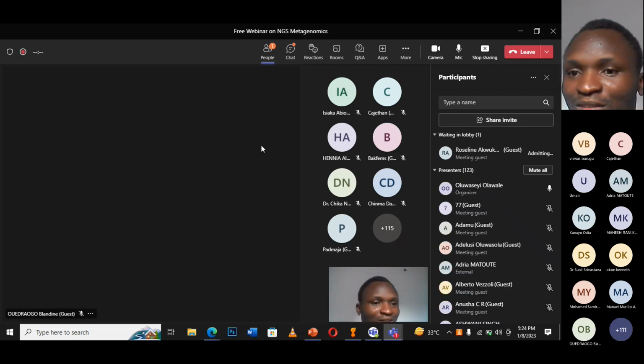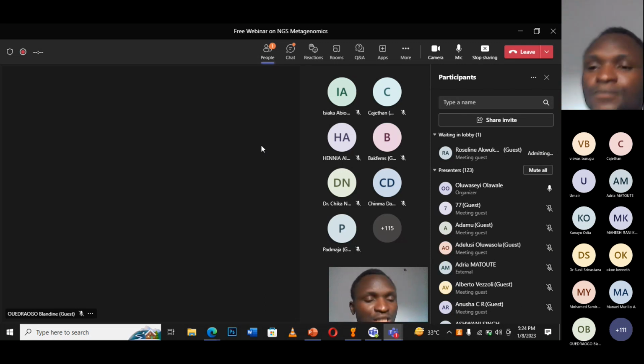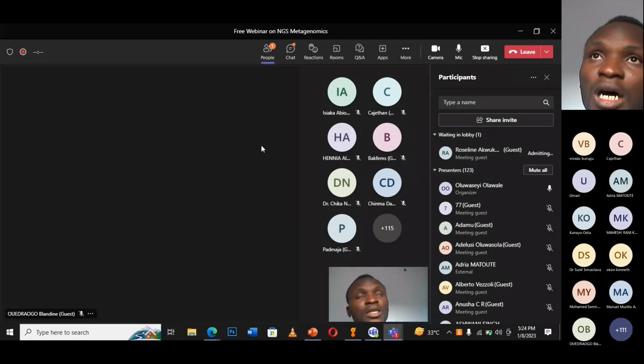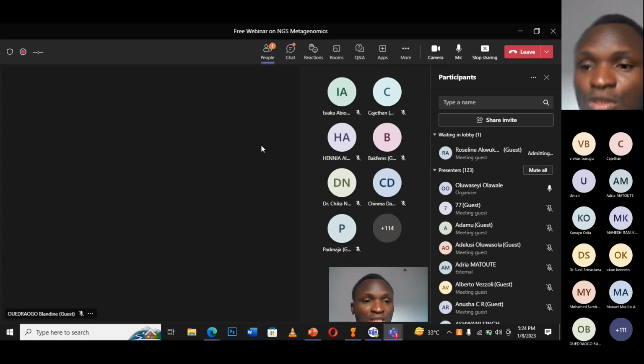So quite a number of different things. Okay, so as I was saying, a few months ago, we were exploring metagenomics techniques or metagenomics samples. We're exploring clinical samples, human gut microbiome samples. We're exploring soil, water, and ocean water metagenomic samples.